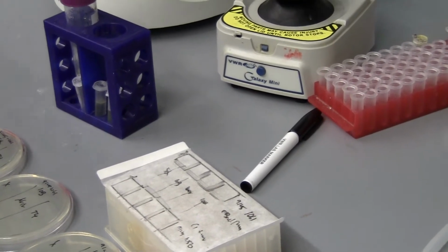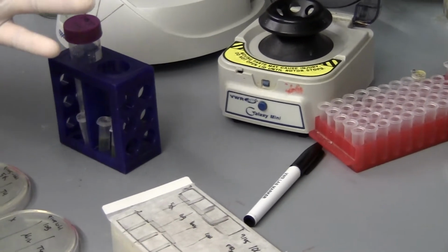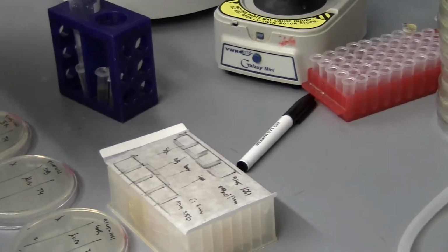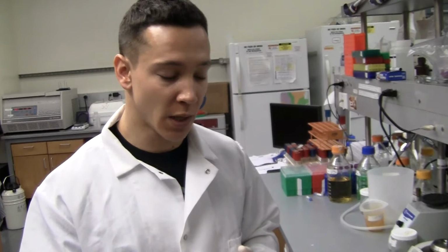So what happens is when the T4 phage infects your E. coli, it shoots its DNA in, it runs its programming. Part of that programming is it makes this protease that goes out into the E. coli periplasm, and then it will prevent infection by more phages. So this is superinfection protection, because once that phage gets in there, it wants to dominate everything.